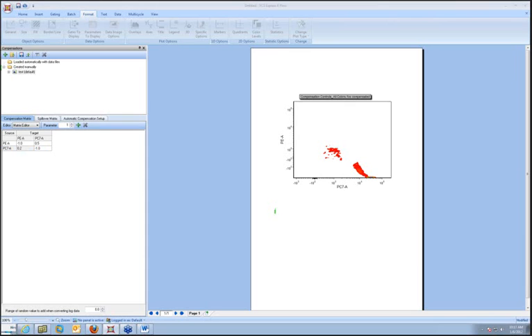Before I go on to automatic compensation, just a little bit more about this form. On the form here, you can do a bunch of things. You can right-click. You can rename a compensation here. So if I didn't want to call it test, I could call it hello. And you can see here that it's now called hello. So you can rename your compensations, and I'll talk a little bit later about saving them and applying them to files and whatnot. Okay, but this form is quite handy.